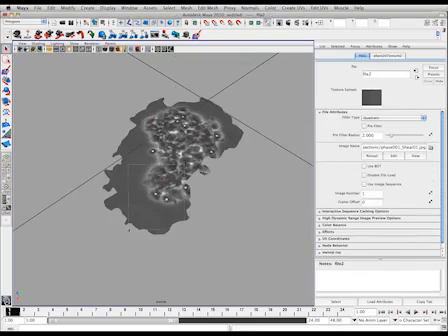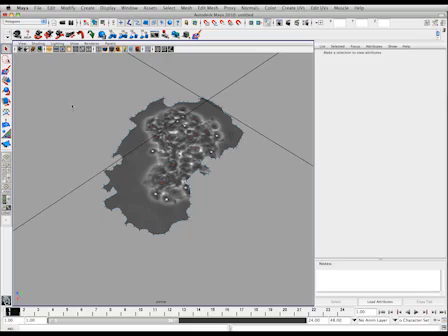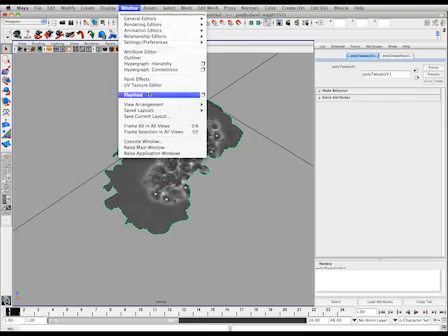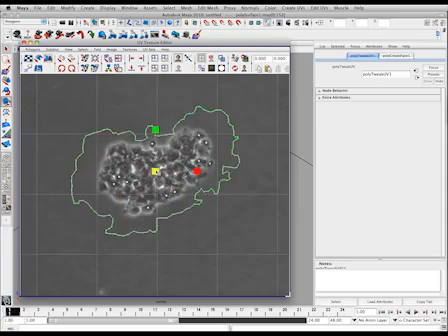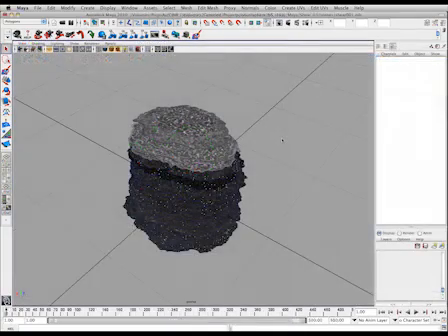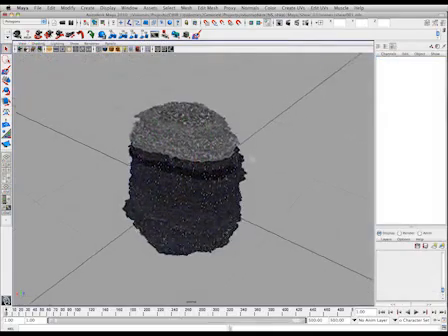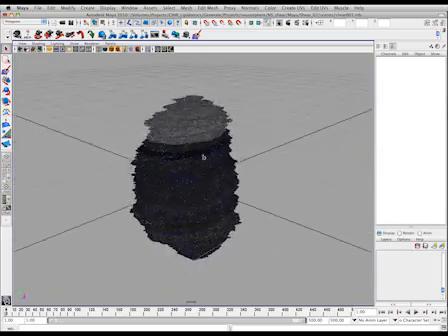With the object selected, choose UV from the marking menu by clicking the right mouse button over the plane. Select all the plane's UV points and open the UV texture editor from the Windows tab of the main menu. Scale the UVs proportionally to fit the section plane. Repeat this process for each section of the neurosphere, ensuring that the spaces between each section correspond to the height of the scale bar.